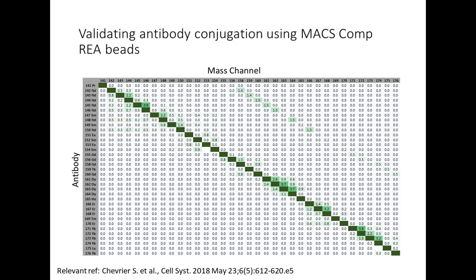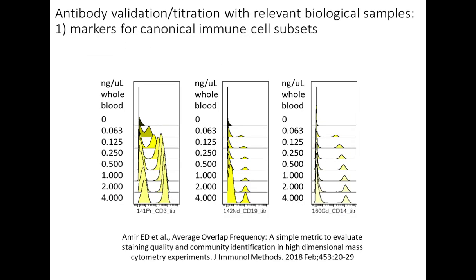Though, admittedly, this is something I don't spend too much effort doing, partly because we don't find the compensation really helps to correct for the underlying issues of mass spreading or sort of dilution of signal resolution, but based on expansion of the negative populations with compensation.